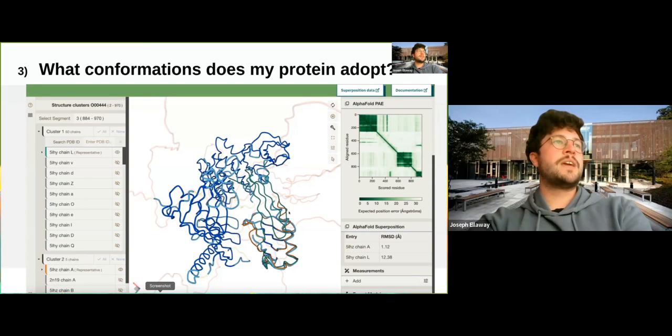We also show pLDDT here, from high pLDDT in dark blue through to low pLDDT in orange, to give you an example of the quality of the model prediction, which also acts quite nicely as a proxy for intrinsic disorder, actually. We also show the PAE here on the right-hand side. This is the predicted aligned error for the AlphaFold prediction as well.